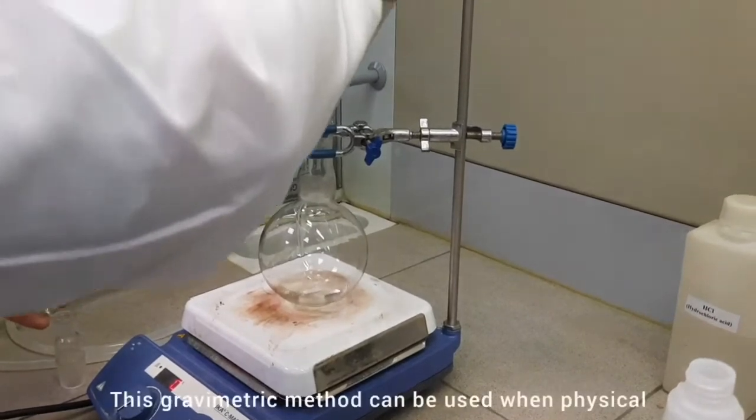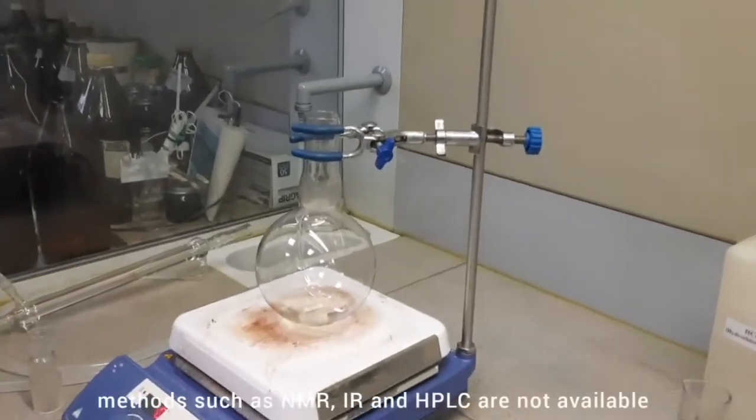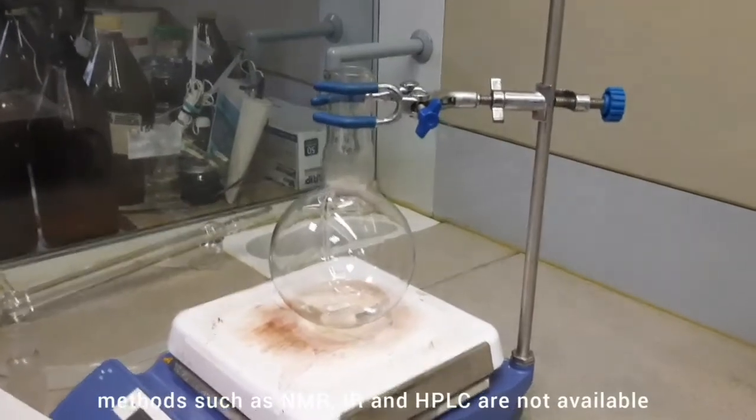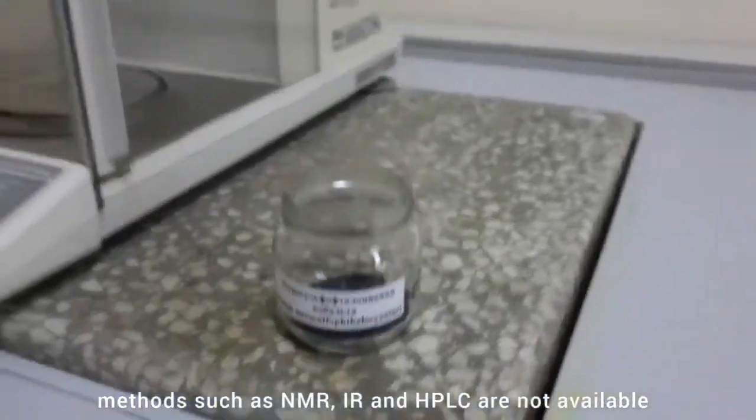This is followed by precipitation of the resulting cobalt sulfate with barium chloride. This gravimetric method can be used when physical methods such as NMR, IR, and HPLC are not available.